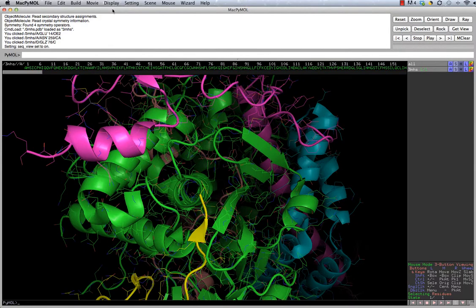And you'll now see a line that appears here in the top that will have every single protein. There's a scroll bar here. Hold down again the left button, and we move across, and you'll see the sequence of every single amino acid colored by those chains. So there's the green chain there. You can see that's quite a big protein. We now have the zinc atoms here that are associated with that domain. These red zeros are water molecules. Let's go past the waters. And now we have the blue protein, more waters, the magenta protein, the yellow, and so on.